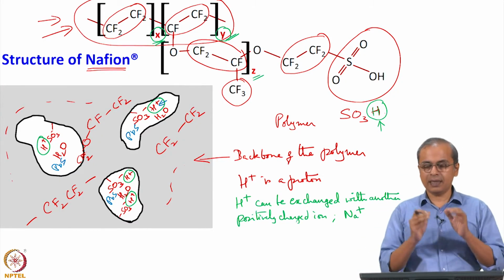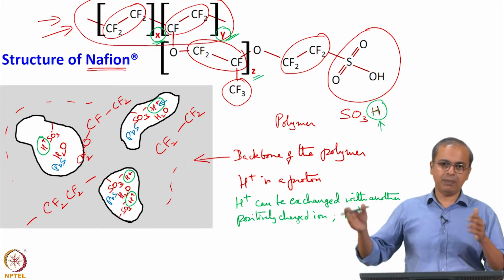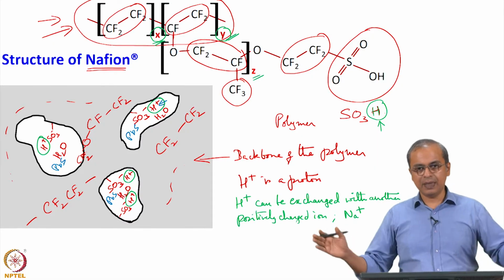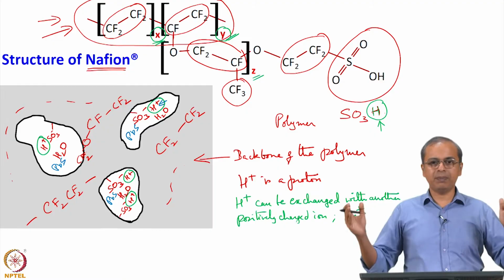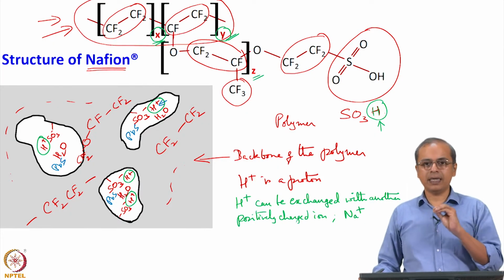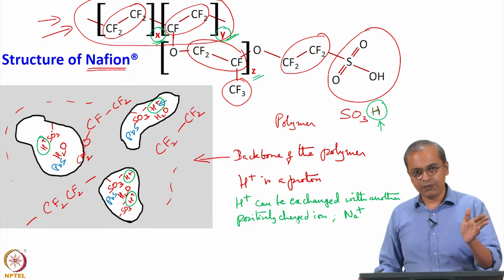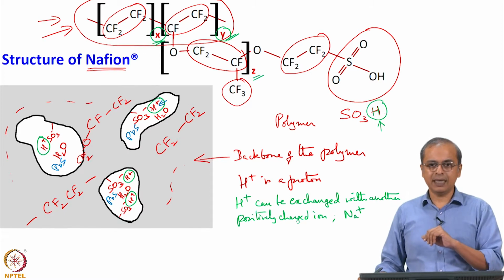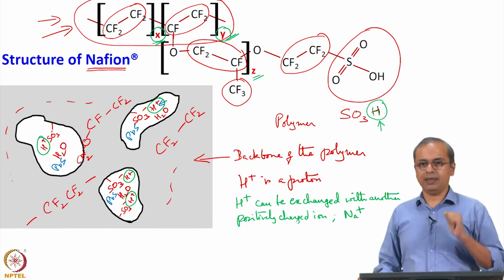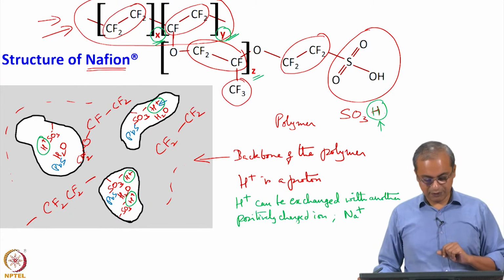Okay. It turns out that if you do this over several minutes, say 5 minutes, 10 minutes, 15 minutes, half an hour, 45 minutes of immersion, some time frame in the range of say 1 minute to 1 hour, if you do a series of experiments, you find that you can get lead sulphide crystals of relatively uniform size scale, wherein the size scale is in the nanometer range, and therefore we can get nanocrystalline lead sulphide.